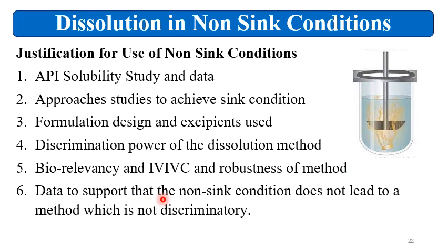Then data to support that the non-sink conditions does not lead to a method which is not discriminatory. That means the applicant should justify to the authority that though the dissolution medium or dissolution conditions are not meeting the sink condition, but still the non-sink conditions are not leading to a method which is not discriminatory.